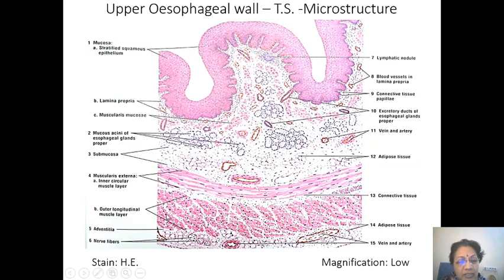are they looking, this one looks a little peripheral. What do you think? The nucleus is peripheral or central? This is looking peripheral, right? Then this one also is supposed to be peripheral. Alright, if you can identify the nuclei to be peripheral to the fiber or to the bundle, then it must be skeletal muscle. So the identifying feature for the muscularis externa layer of esophagus may be that its muscle is skeletal because the rest of it is smooth.